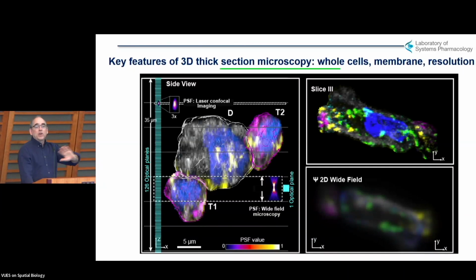Now, what a conventional microscope would do is just take a single slice, and its image plane is shown there in blue. So, by the way, as you go 3D, 3D means high resolution means 3D. So they're actually conjugates of each other, except under special circumstances. The other thing you can do is then make virtual slices out of this. You can say, what would I have seen, now that I have 3D, if I did 2D? And so we'll make a bunch of virtual slices, and then we can blur that out so we can actually now recreate virtual 2D data of the type most of us use.